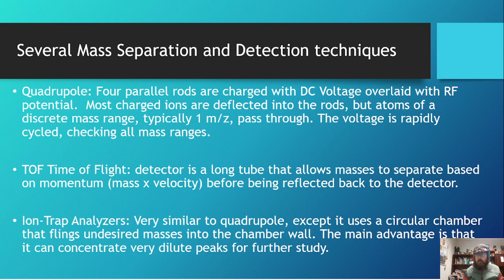And so people who try to study these systems to death might use this to figure out, oh, this unknown fragment is actually an isopropyl group or something else. What is this group actually? So by building up this possibly dilute compound, we can build it up to large enough quantities that we can study it. But for the most part, we use quadrupole.